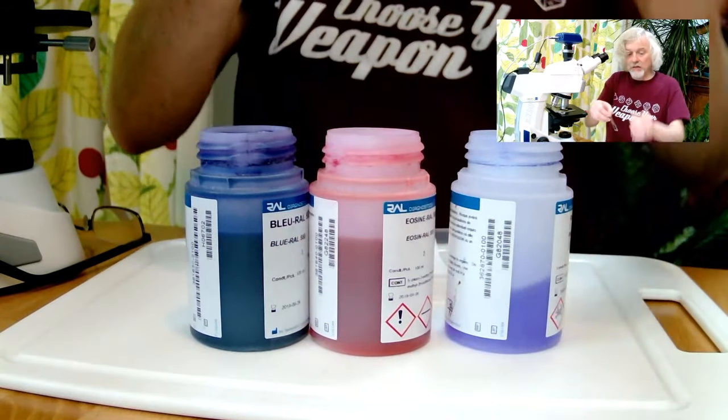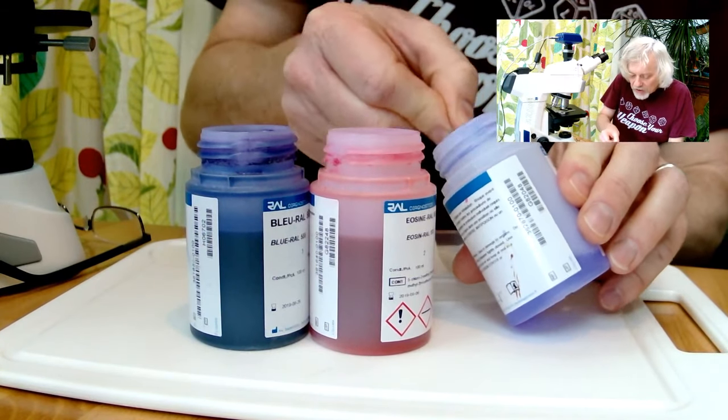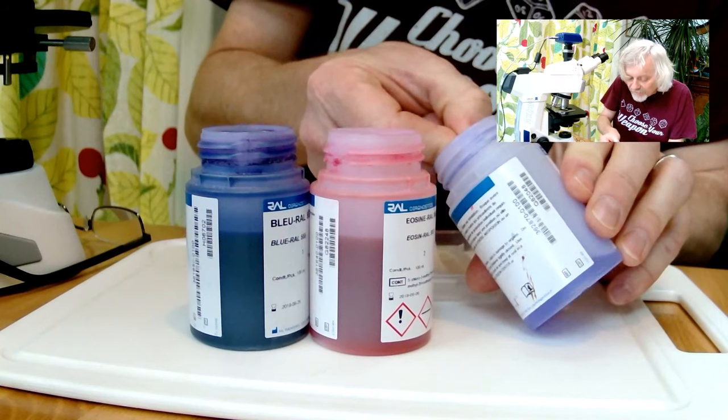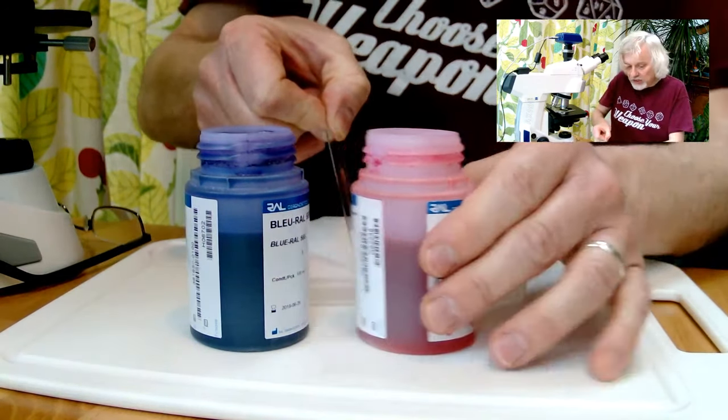I'm going to go in that way around. And I go in for the count of five. One, two, I'm running out of methanol. Three, four, five. And then I do that. I'll get rid of that chemical, and I'm just blotting it on the other side.